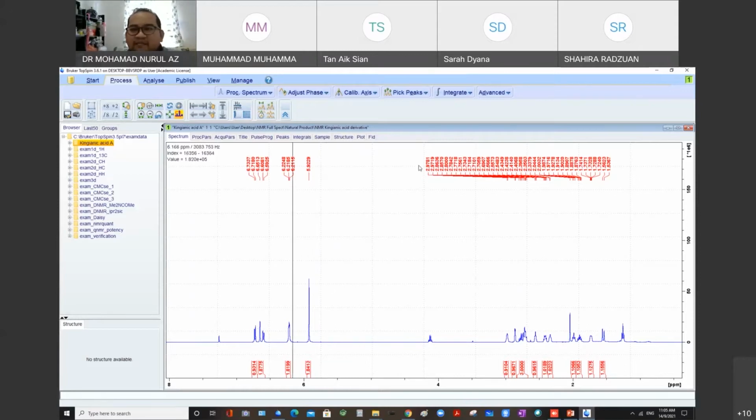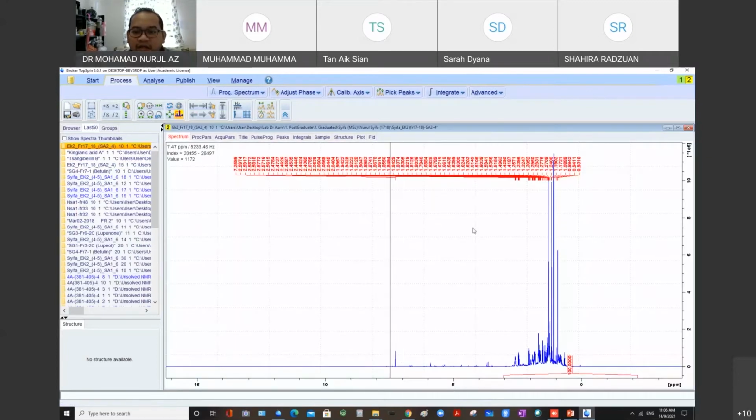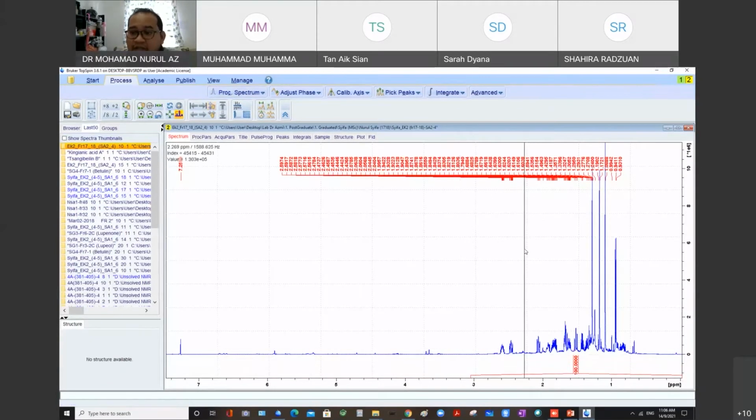Let me show an example like this. I try to process. This is for me a pure compound, but if you try to report like this, it is acceptable.